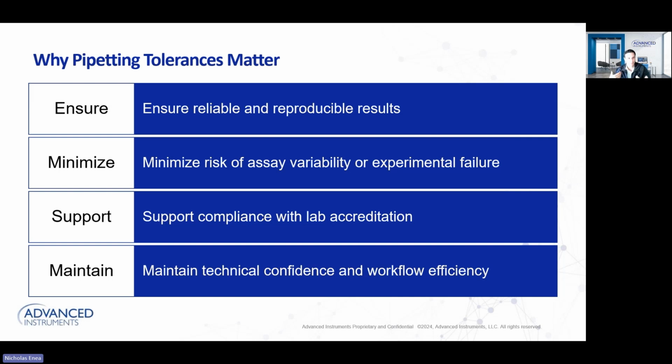Another thing that we strive to do is support compliance with lab accreditation. Those of you on this call probably work in different parts of the lab, whether it be clinical or in biopharma, and are probably under different accreditation bodies or different regulatory standards. Ultimately, we want to be able to support whatever accreditation or standard that we're under. Lastly, we also want to maintain confidence in workflow efficiency. We want to make sure that all of our liquid handlers are performing the same, and all of our operators that are pipetting are performing to the standard that we need for our general practice and for our lab. So this is why pipetting tolerance matters.